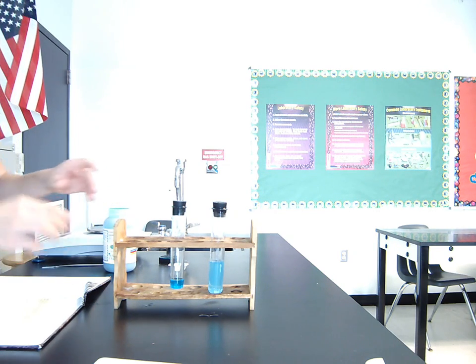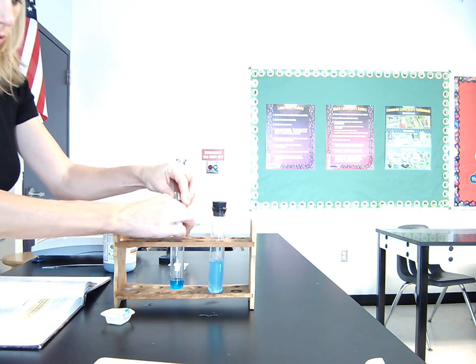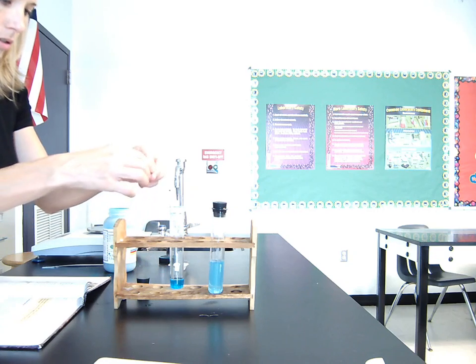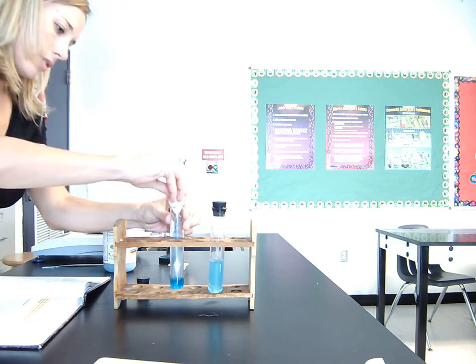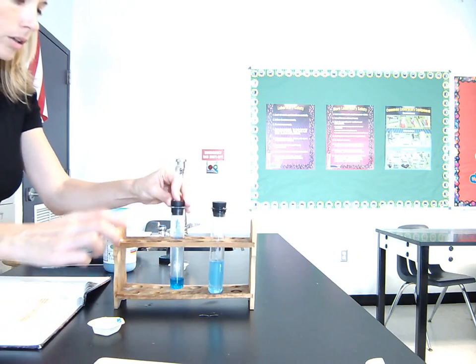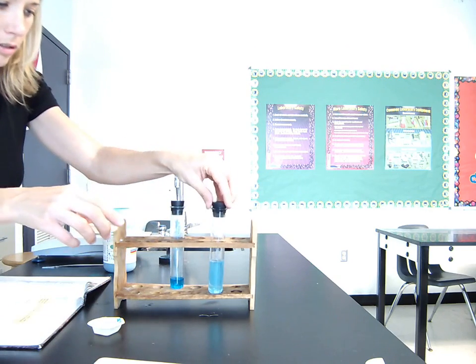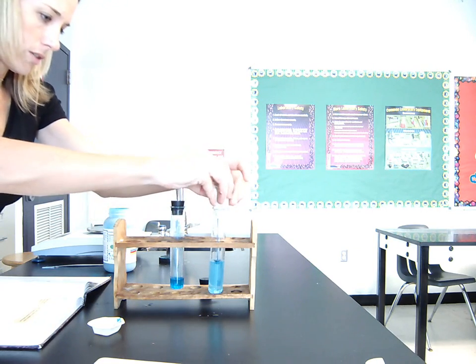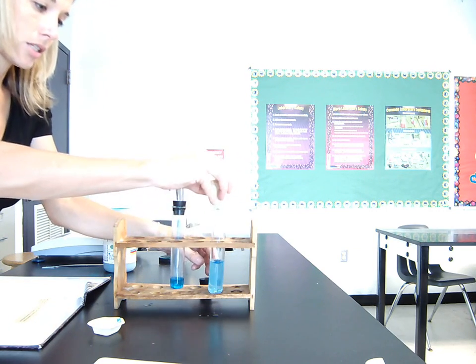Alrighty, so I have 0.15 grams in each of the massing dishes. So let's add another 0.15 for a total of 0.3. And to this one, another 0.15, which gives us a total of 0.3 in this test tube as well.